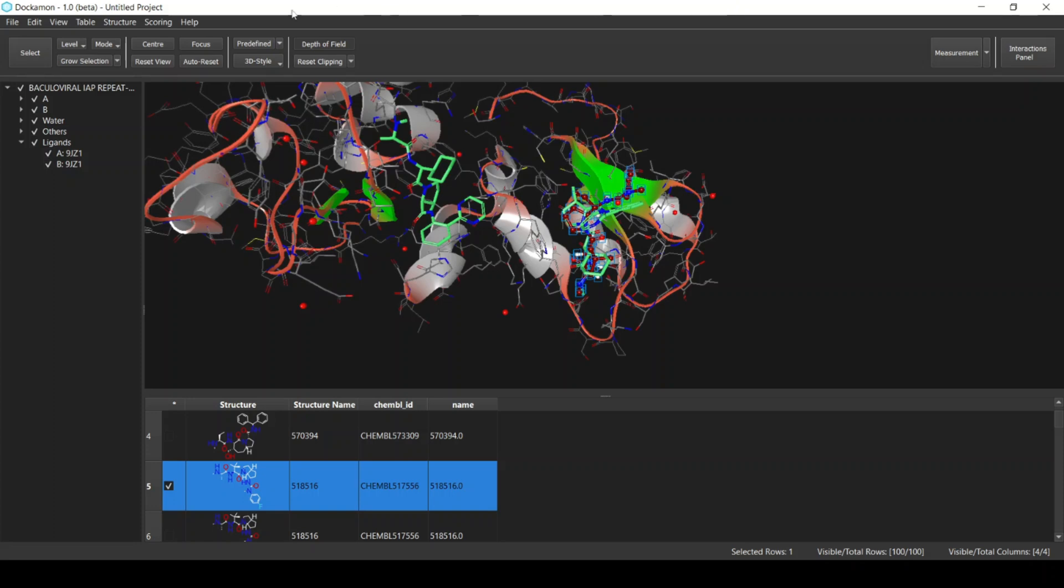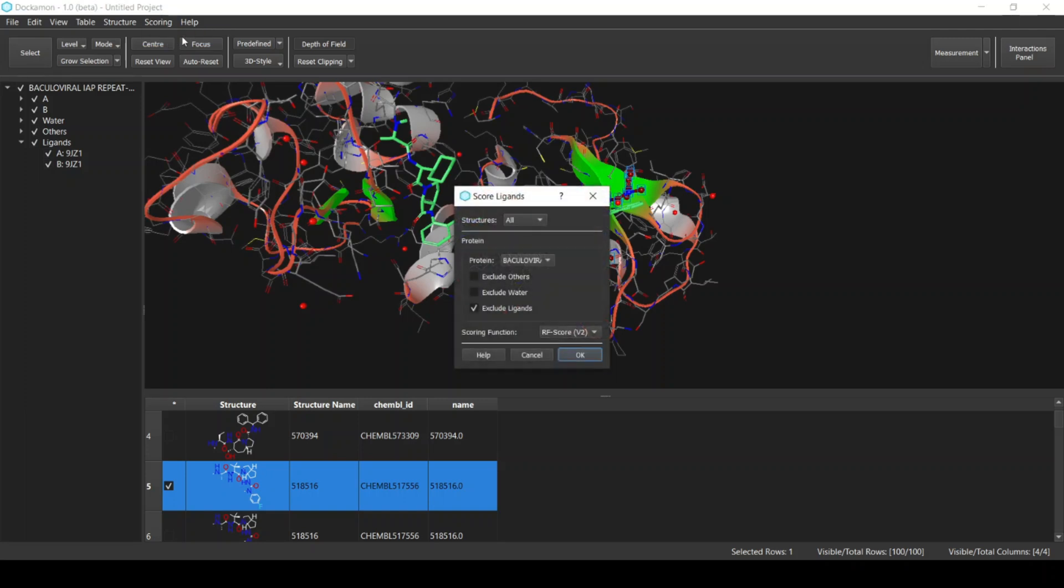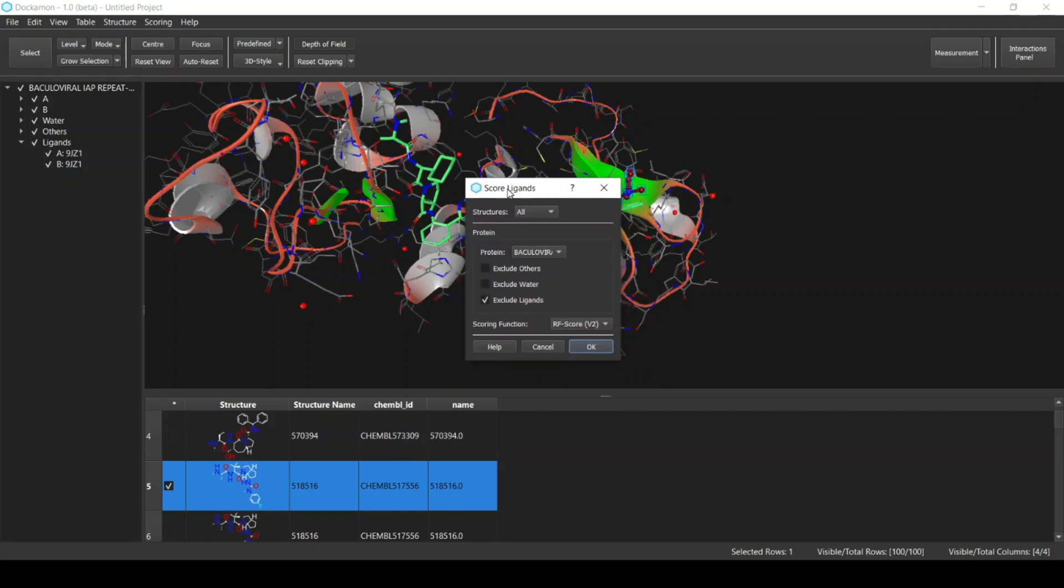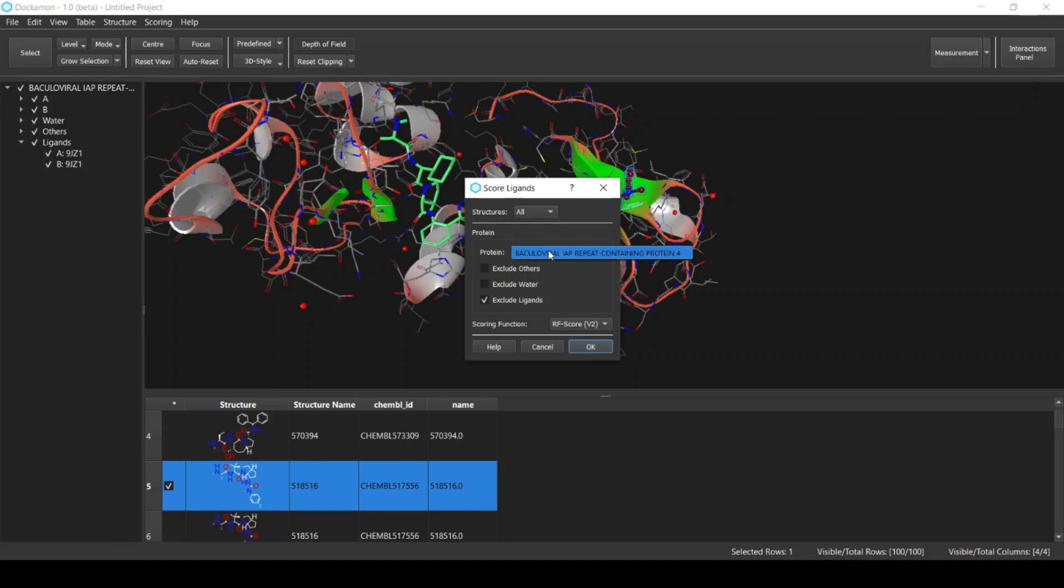Next we can now perform the scoring process. From the Scoring menu, select Scoring Ligands. From this dialog we can select the options for scoring the ligands. First of all, these structures are the ligands in the table and we want to select all the ligands. Next, the information for the protein: select the protein name that you want. Here we can select which residues that we want to exclude from the protein in the scoring process.